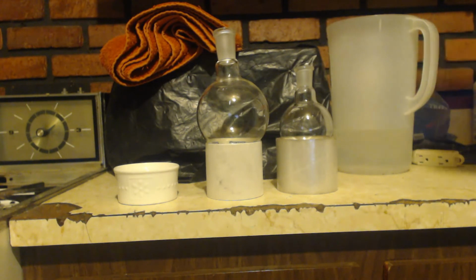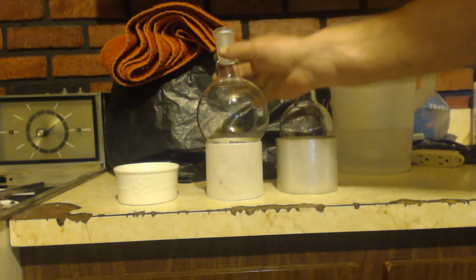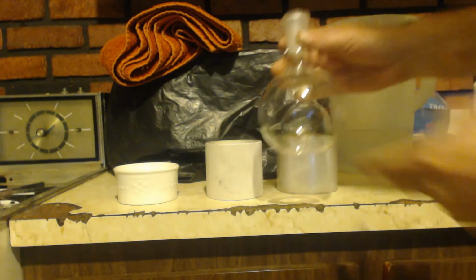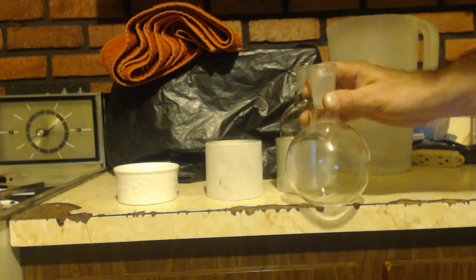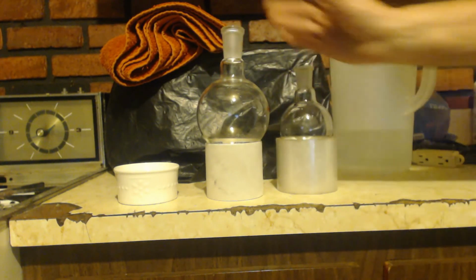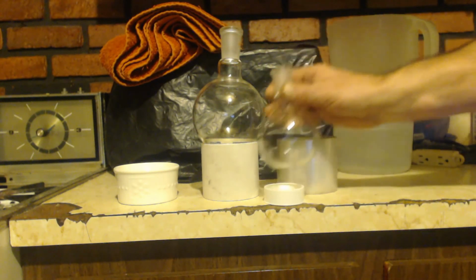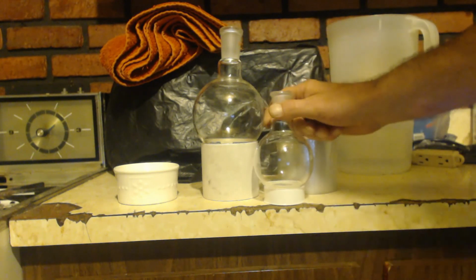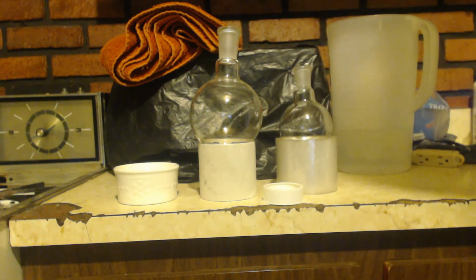Another suggestion, I wish I had my board here because I've done it, I can't find it. But I just got a flat piece of board, about this big, and I drilled holes in it. But you got to make sure that the hole is not too big so that your round bottom flask hits the table. You want it high up so it sits in that hole. But you don't want it too big or too small to where it's going to roll off either. Then you can just put it right in that hole. See how this isn't touching the table, and you have a lot of friction between the wood.